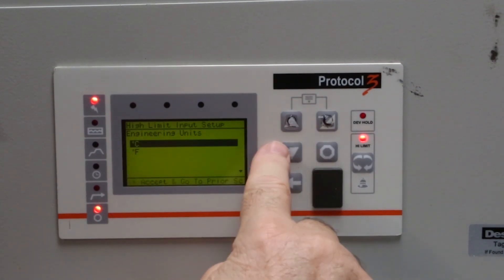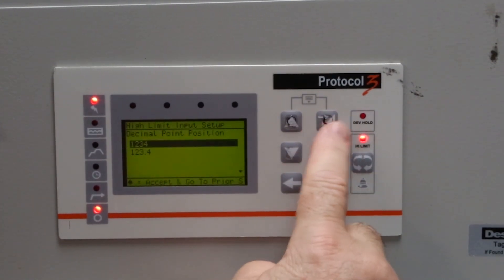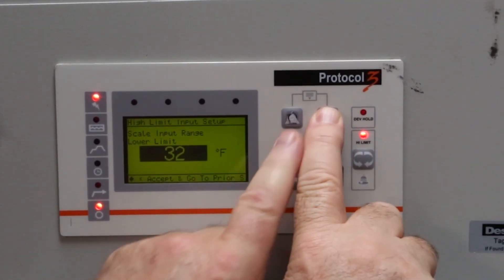From here, you can change the engineering units using the arrow keys. When the desired unit is highlighted, press enter. Then press and hold the enter button and cycle the up arrow to exit.